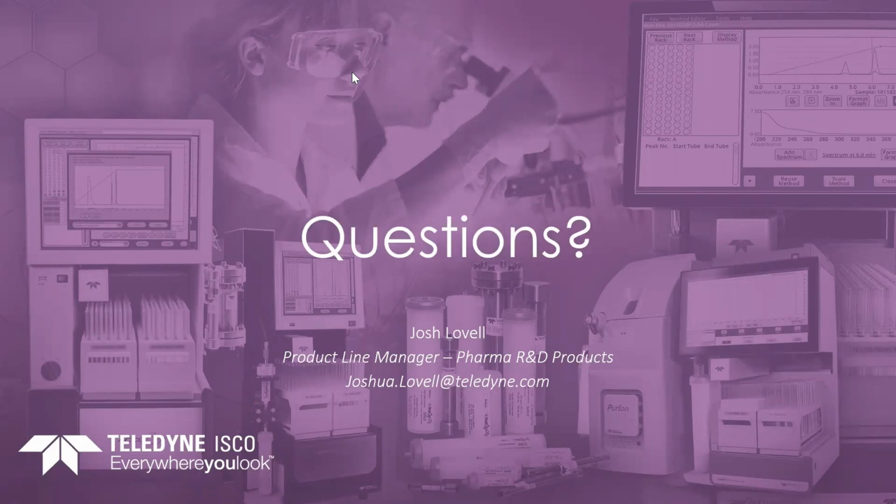Another really good question here is how to wash the system between two different polarity mobile phases, or if we're going from reversed phase to normal phase use. So the manual control screen is really important in this case, because you need to flush out the entire flow path with a miscible solvent. IPA is a great choice because it's miscible between water and hexane. You can flush the system with IPA and then switch to your new weak solvent.